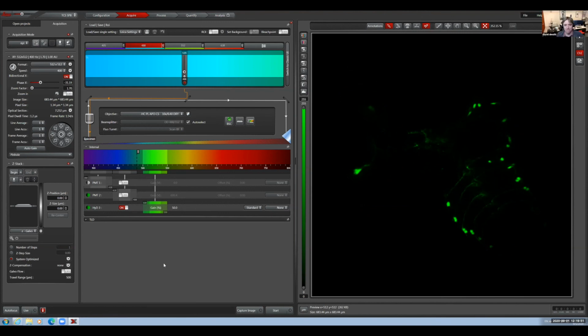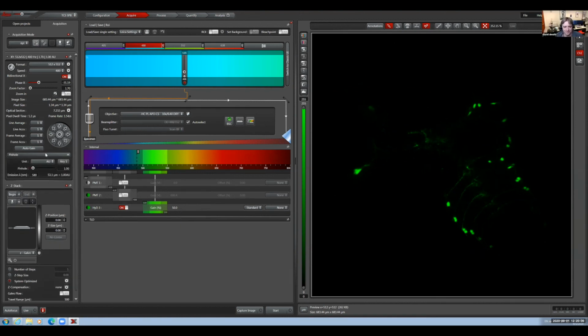Mm-hmm. Sometimes I can memorize how to click things and not even know what I'm clicking. I just know where it is. Yep. You're like, click, click, click, click, click. You know what to do. And then if they ask you what you did, you're like, I can't quite remember. It's the thing on the left below the zoom, right? Yep. Because like I was saying, learning this and teaching it is different than being in a lab where you're just doing one thing all day. Yep, exactly.